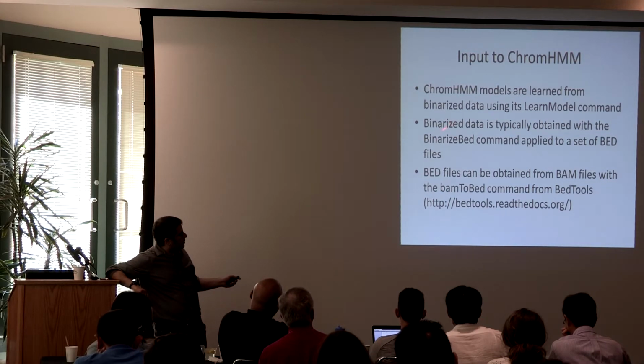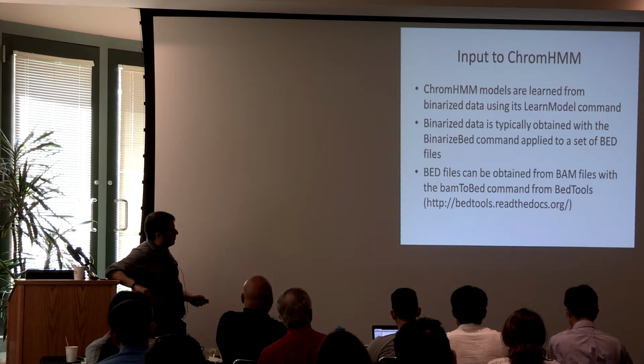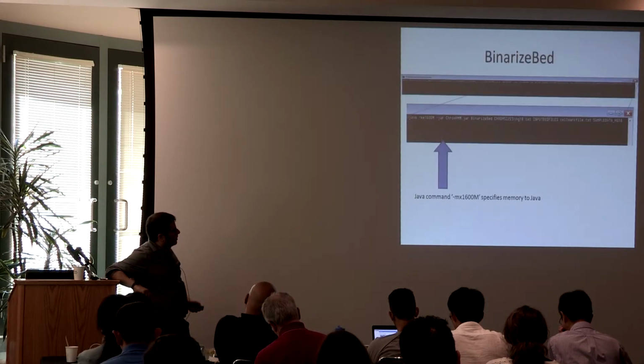And then if you have BED files, you run this command, BinarizeBed, which I'm going to go into details about. So the main thing is, of all your reads, we're going to assume you have BED files of them. There are other ways to form this binarized data, but I'm going to assume we're working off of aligned reads.